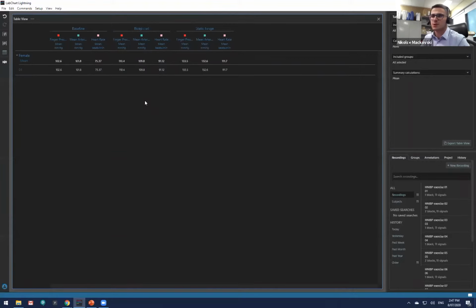All I've done was just drag and drop a few different regions, give them a name, and because I put the signals superimposed on top of each other, I remember I had the heart rate, the finger pressure, and the mean arterial pressure, I put them all in one channel. Now we have all this data. So it's a really simple way of collecting a lot of data really fast.